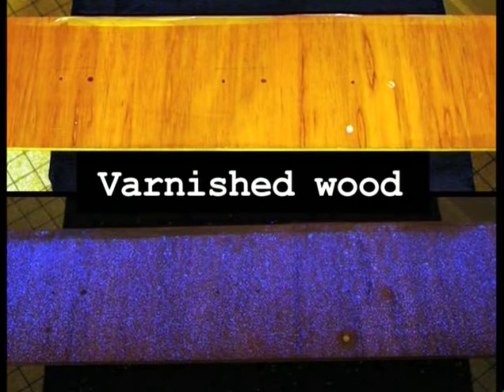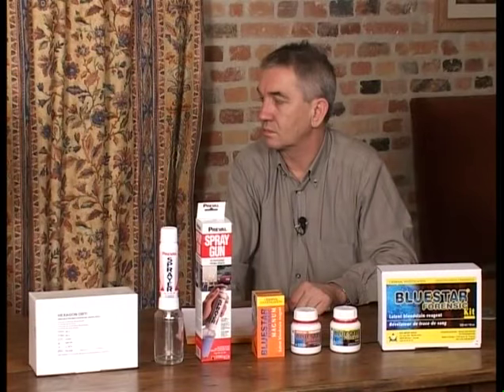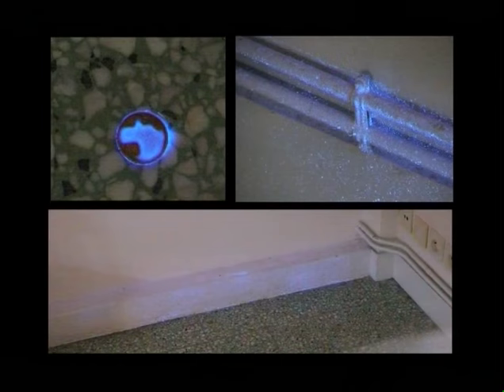Then we must make sure that it is actually the presence of blood that is reacting and not the medium. For example, in all luminol-based solutions, we know that certain varnishes found on wooden furniture will cause a reaction, but that's not caused by blood. So when we have a reaction, we must always spray the same medium in a zone where we are certain that there is no blood, to ensure that this is not the medium that is reacting. This is the negative test.